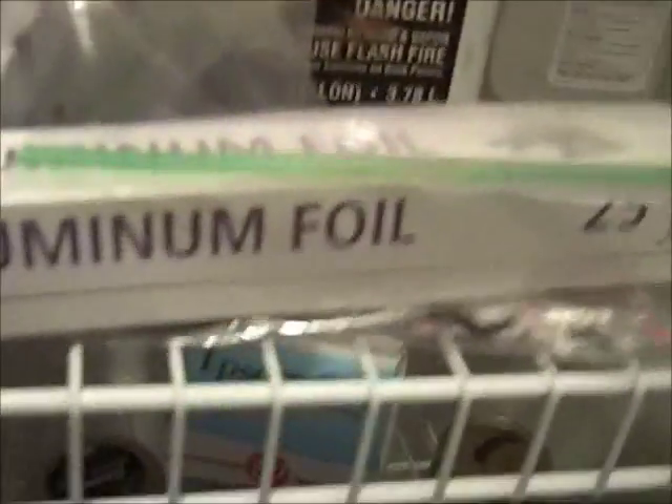Alright, next I'm going to talk about my metals that I am using in this lab at the moment. I like to keep bags of my metals because they're convenient to look at and just see what I have, and they concentrate all of my samples in one bag, which can be good at times.